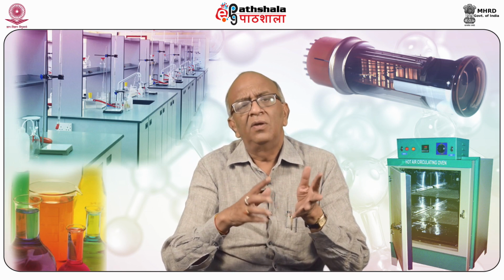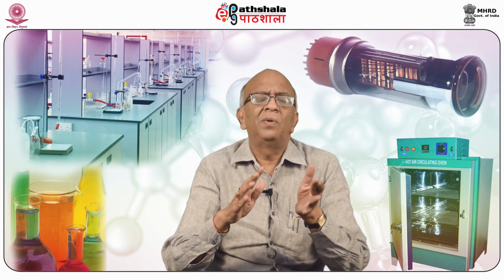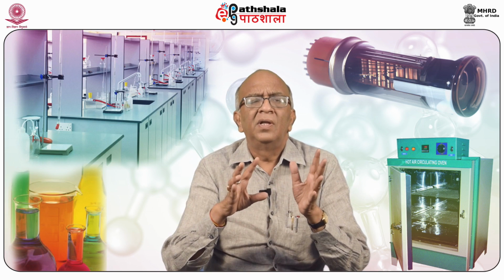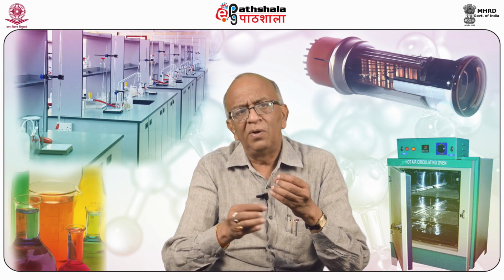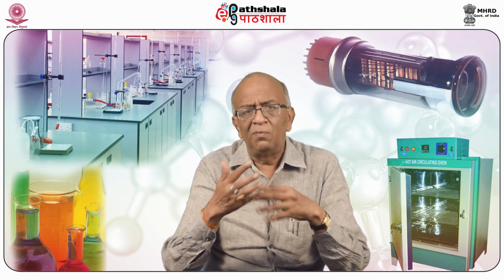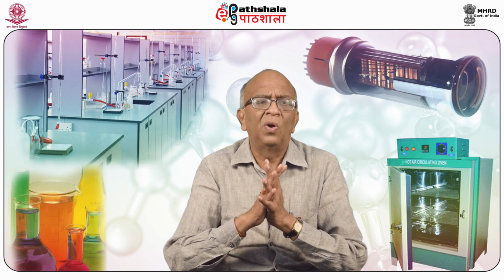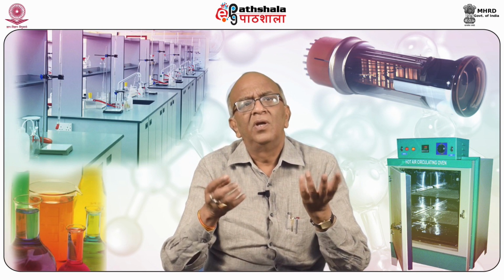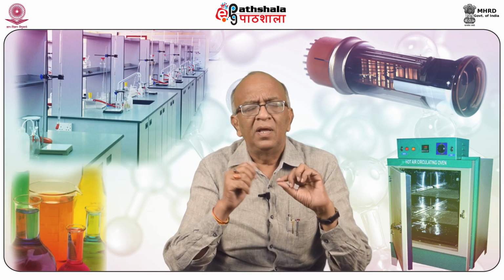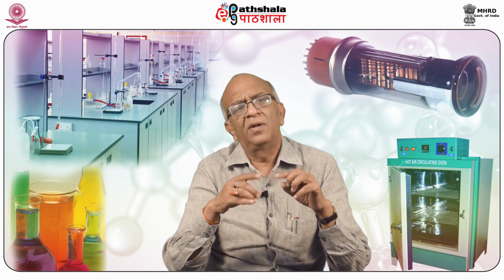Even then your burettes and pipettes may not work well, because if you leave the pipettes and burettes after use and do not wash them, then some chemical will deposit. Or in the case of glass joints, some chemical will deposit and the glass joint will not be loosened in any case. As in the case of a measuring flask, you put a stopper there with the help of a glass joint, but that glass joint will not open if some chemical remains there.